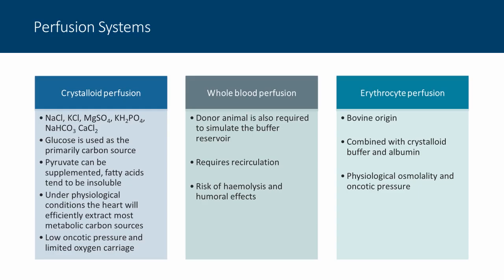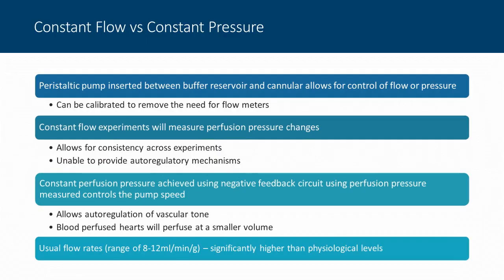The next thing we need to consider when developing and describing our experiment for Langendorff perfusion is whether we choose to use a constant flow or a constant pressure system. And ultimately, it relies on the biological question we're trying to ask with our Langendorff setup.